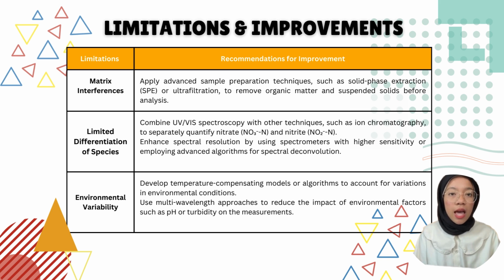To address this, advanced sample preparation techniques such as solid phase extraction or ultrafiltration can be employed. These methods help to remove interfering substances, ensuring more accurate and reliable measurements.